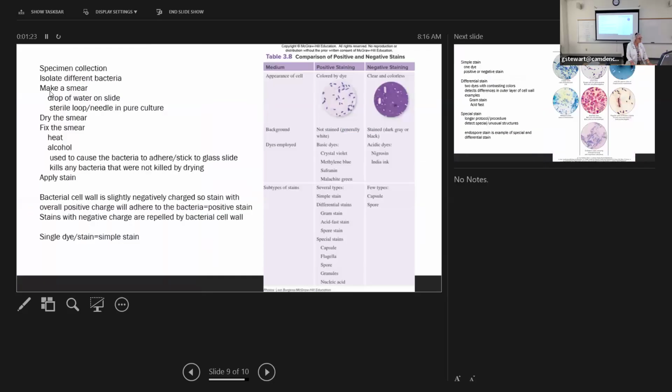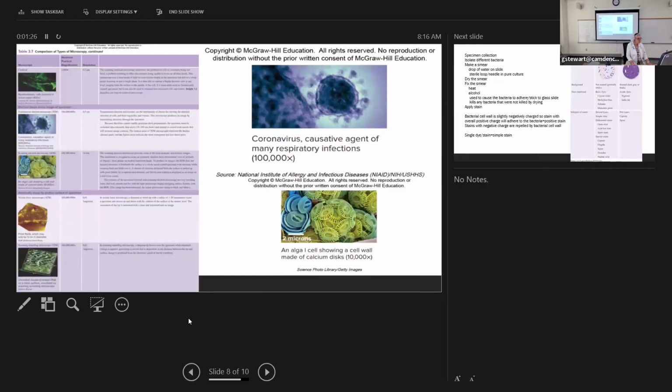I think we should also mention confocal microscopy. This one up here in the corner. It's a version of compound microscopy. So what was I up to? E, right? E. Compound bright field, phase, fluorescent. B, C, D, E, yeah.